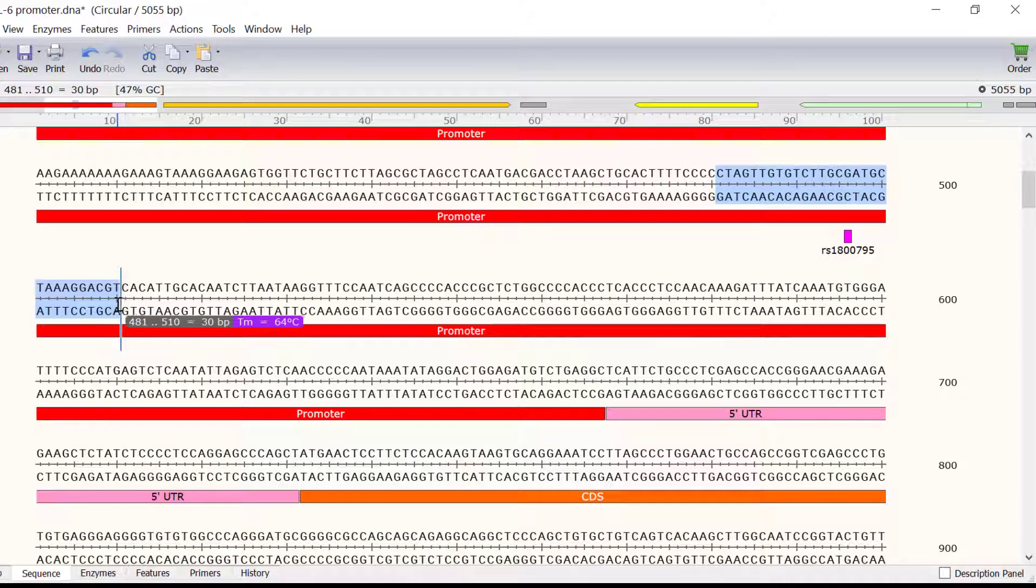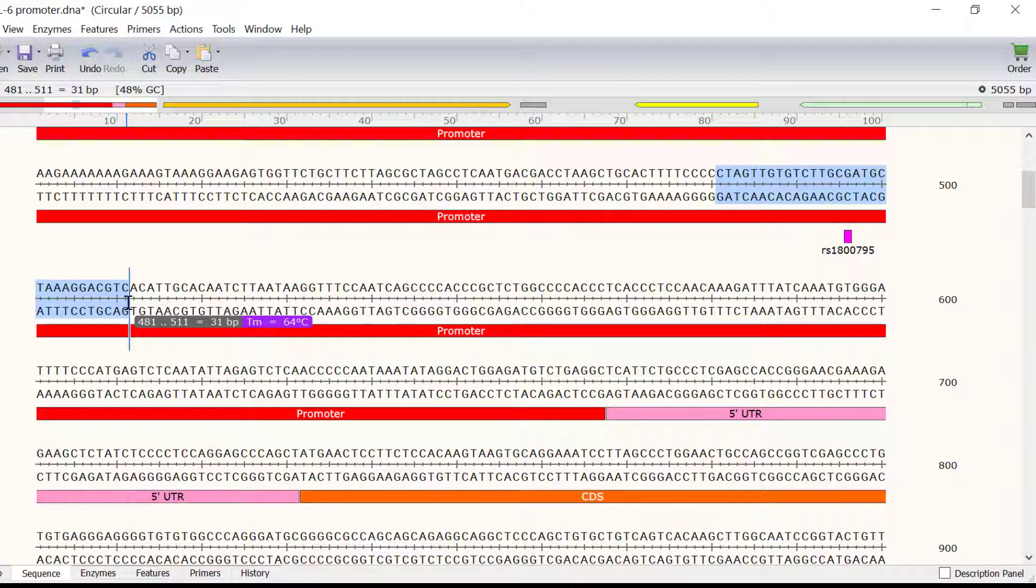Note, I will ensure the mutation is placed directly in the middle of the primer. So, this means I have a selection of 31 base pairs in total.